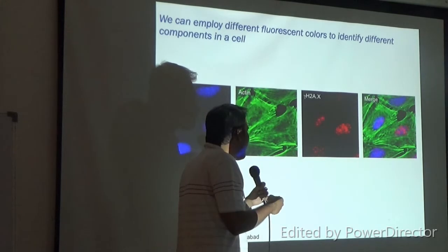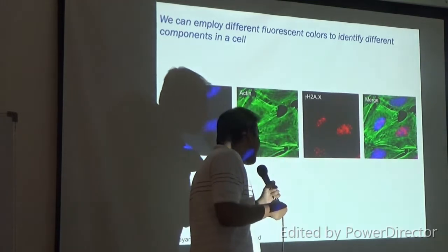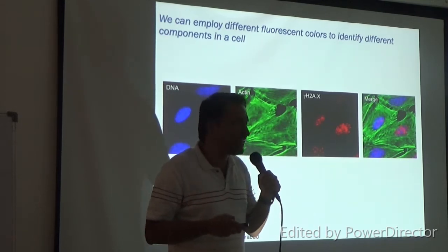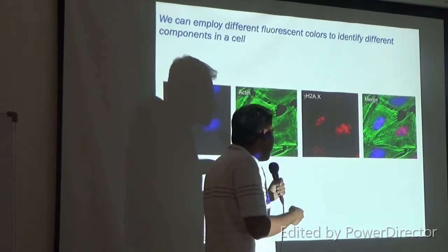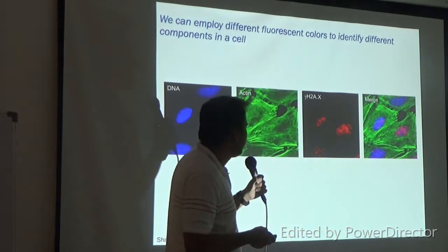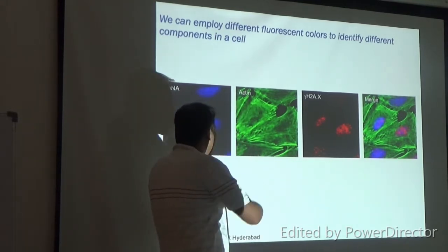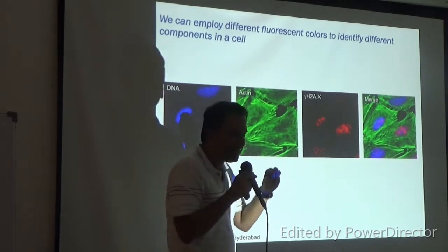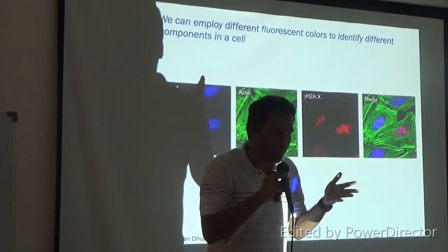And this is a particular histone protein marked with an antibody which has been detected with another antibody, and in this case, the antibody is marked with, say, Alexa 568, which will be excited at 568 nanometers, which is greenish, orangish, and emits at about 580 nanometers. So it emits in orange, where these colors are false. I could make this pink if you want. But the point that I'm trying to make is that by tagging different components in a cell with different fluorophores, we can image them separately.